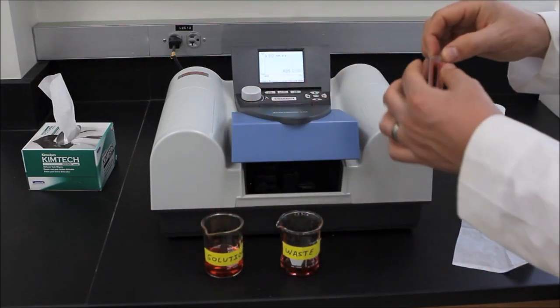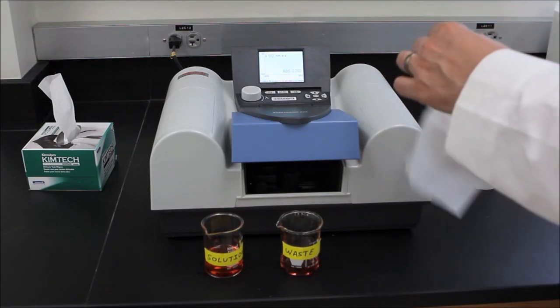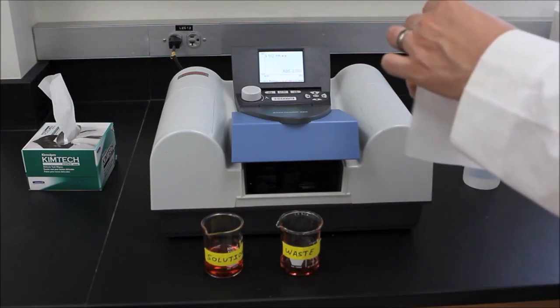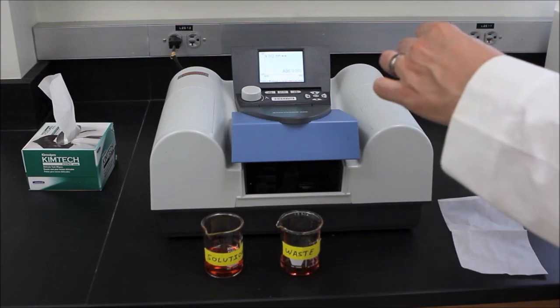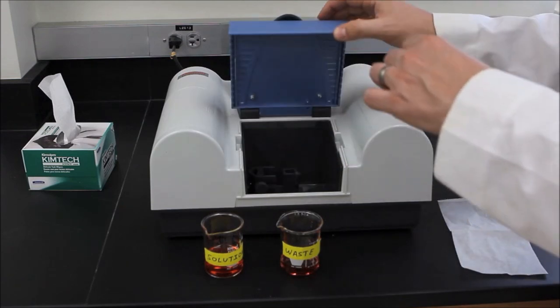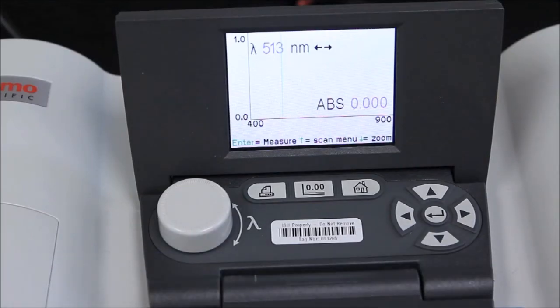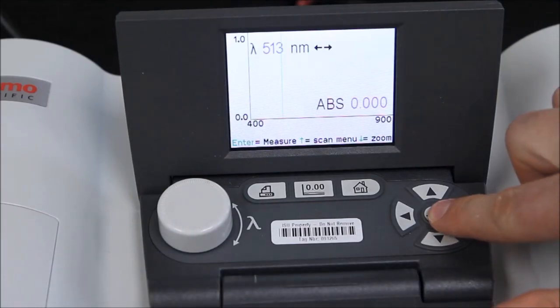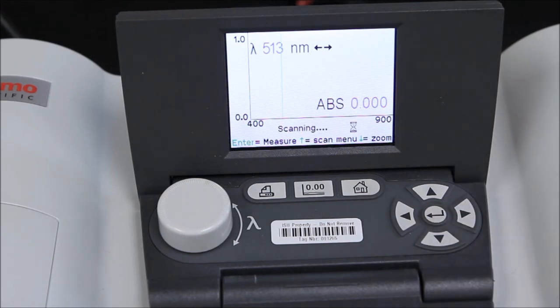Make sure to wipe the non-frosted sides with a chem wipe. Then place the cuvette in the cuvette holder oriented such that the triangle is facing to the right. Close the sample compartment and press enter to generate an absorbance spectrum of your solution.